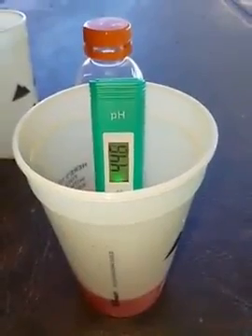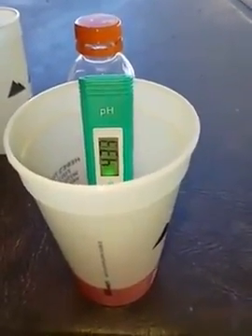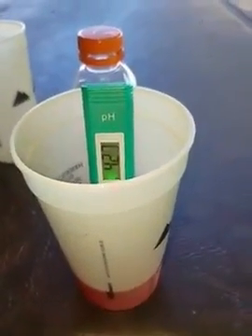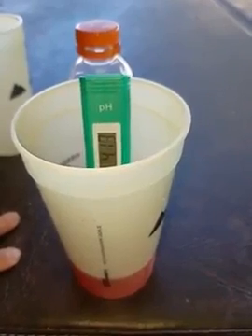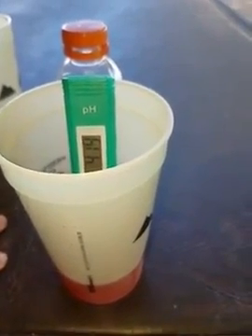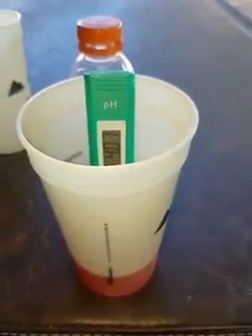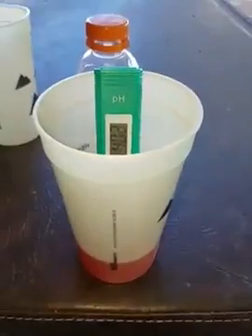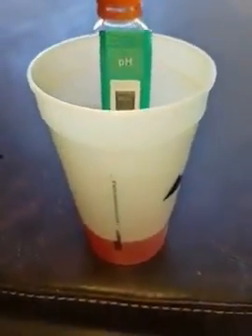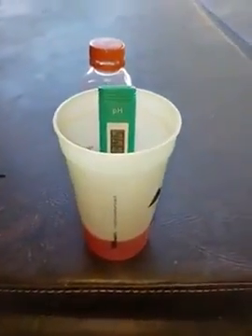What you want to do when you first get it, of course, is clean it with distilled water and everything like that. And then when it's done, you're going to wash it again with distilled water. So it's reading about 4.15 right now. Going down. It keeps going down. So, like I said, you just want to wait till it stabilizes out. Not a big deal. And while that's doing that, I'm going to get my hot tub water.